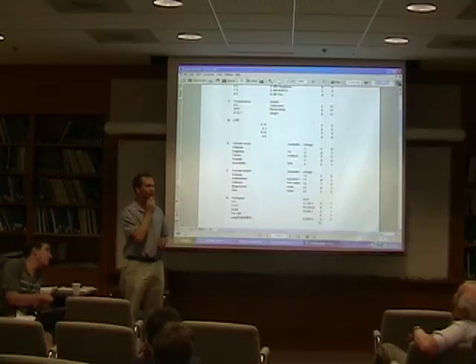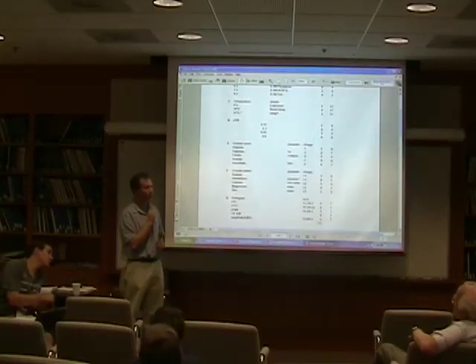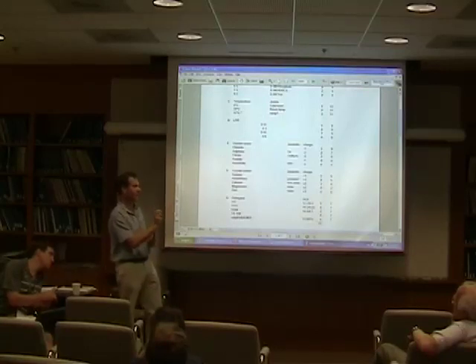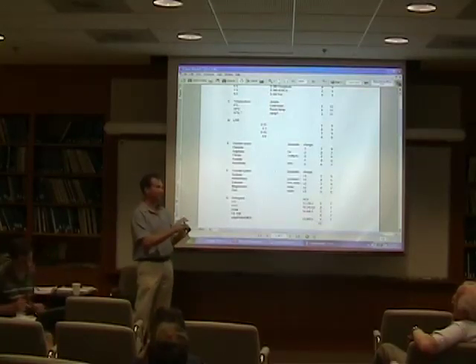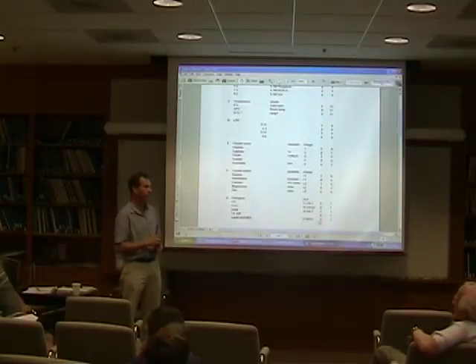So there are two aspects to that. One is you could just put it in, but that's what Carter and Carter did, and they found there were certain conditions which just didn't work, and they then eliminated those from the screens as well. The other thing is they actually looked for a couple of conditions which help. So not only do you find what the main factors are, you might find that temperature and OTG are somehow coupled. So you will also find this.